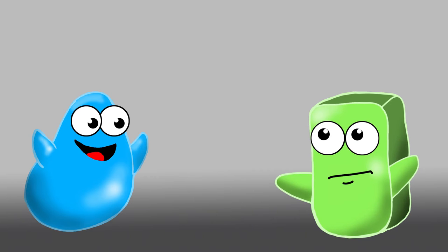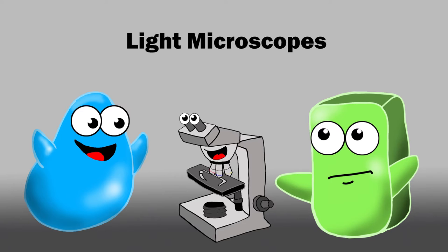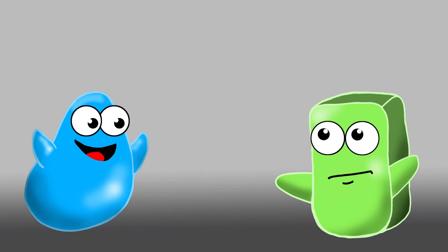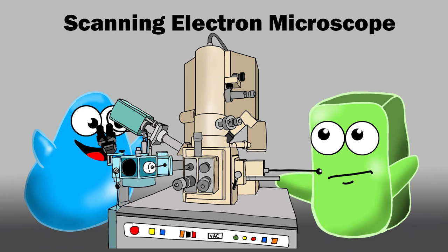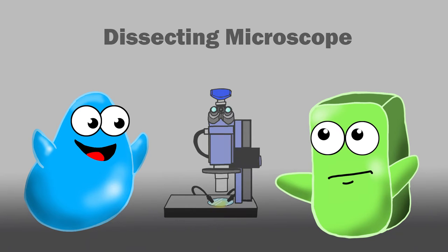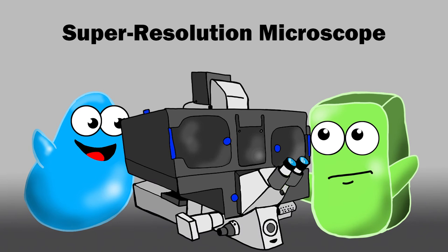But why are there so many different types of microscopes? I mean, you have light microscopes, and confocal microscopes, and transmission electron microscopes, and scanning electron microscopes, and atomic force microscopes, and dissecting microscopes, and... Don't forget super resolution microscopes.